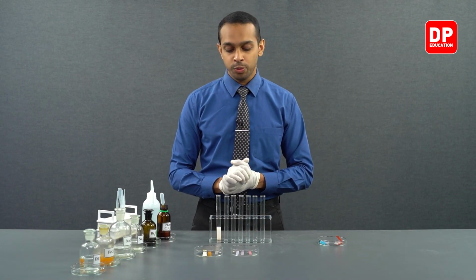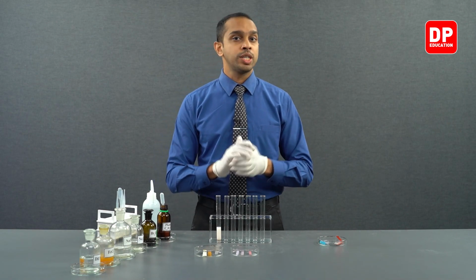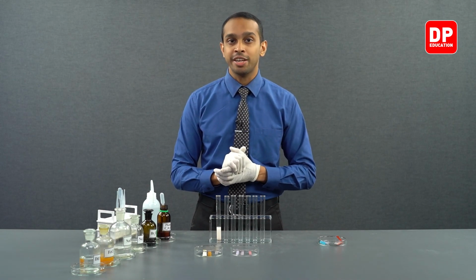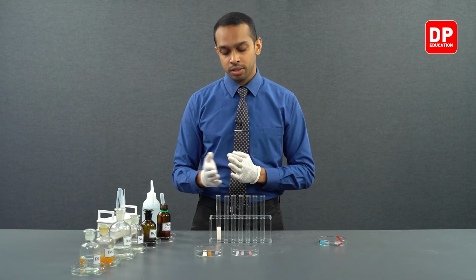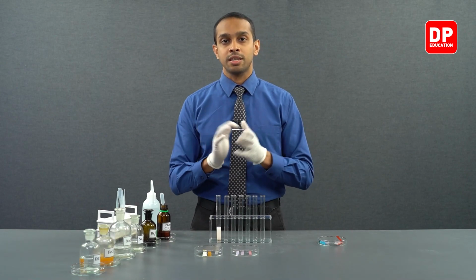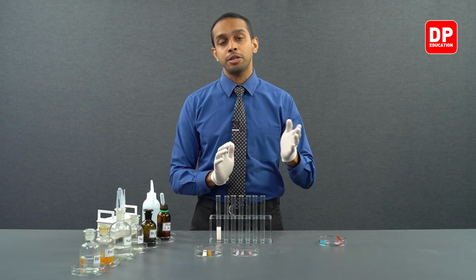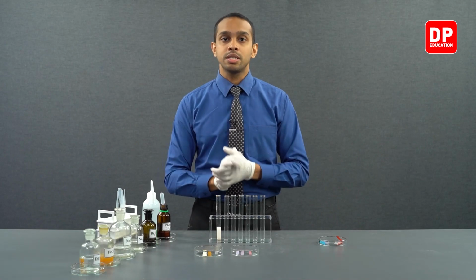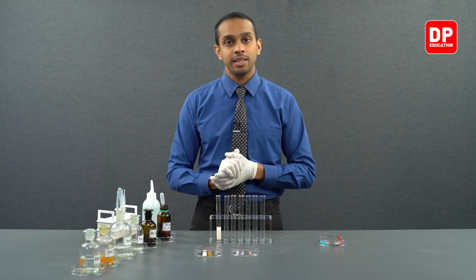Now, let's move on to the summary. We observed that phenol was moderately soluble in water. 8.3 grams of phenol can dissolve in 100 milliliters of water. And apart from that, we noticed the phenol solution that we made is slightly acidic. We observed this with the use of litmus paper. We saw the red litmus paper did not change into a blue color, indicating that this in fact is acidic, and the blue litmus paper turned into a red color, confirming that the phenol solution we have here is acidic.